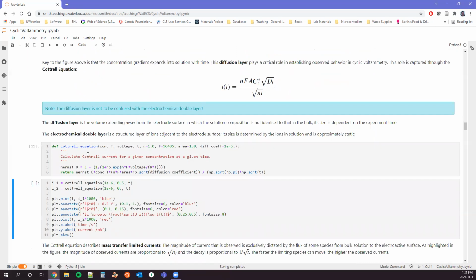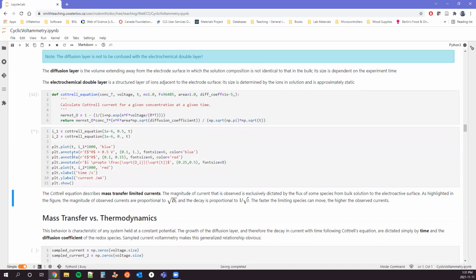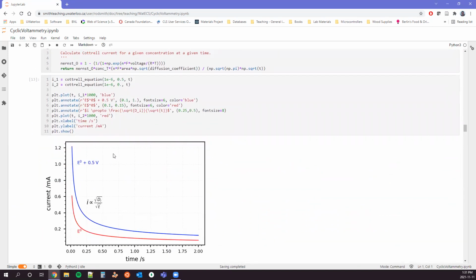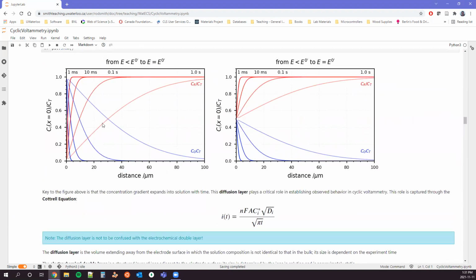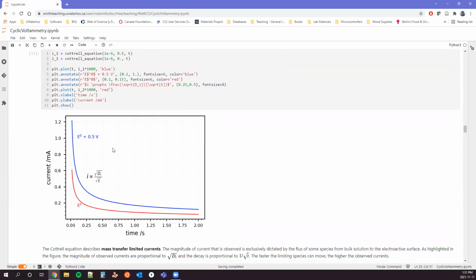And so we can view this, and so I just typed the math in here. So essentially just taking that equation, and we can plot it out. Right? And so what we're looking at here are the effects of these two different steps, right? And so we see this growth of the diffusion layer when we apply E much greater than our formal potential, and so we're doing 100% conversion, versus this portion where we're doing a 50% conversion. And so we see those here.